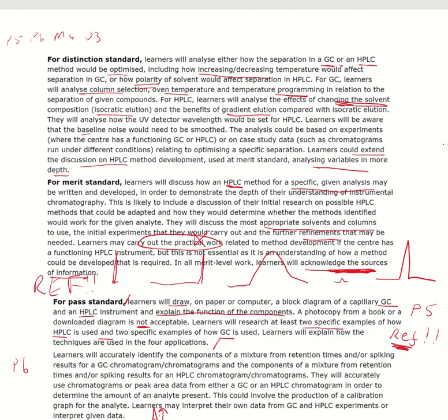You may be aware that there's baseline noise. So what that means is that it could be you've got maybe baseline noise that you want to try and get rid of because you want this peak to be nice and clear away from it. And it's a bit messy if it's drowning within all of this stuff around it. So how can we get rid of these?